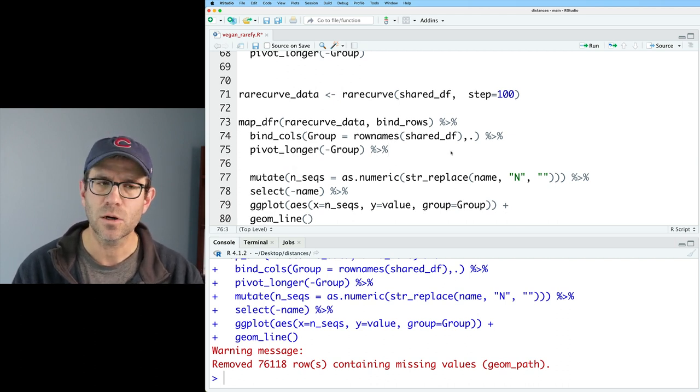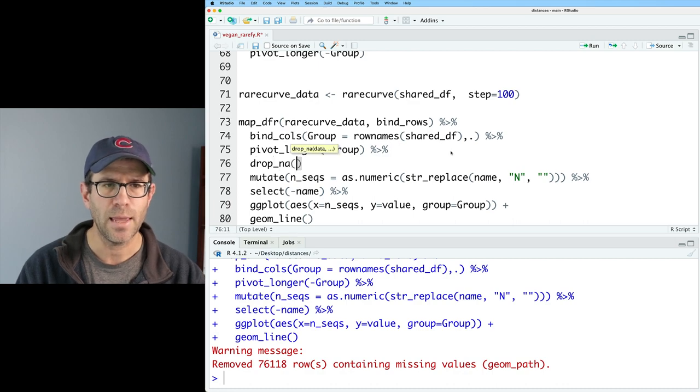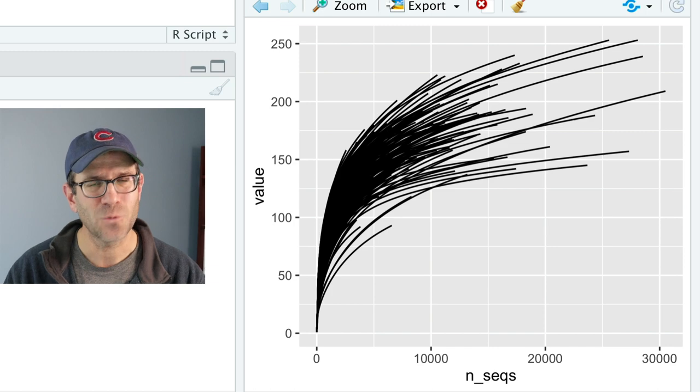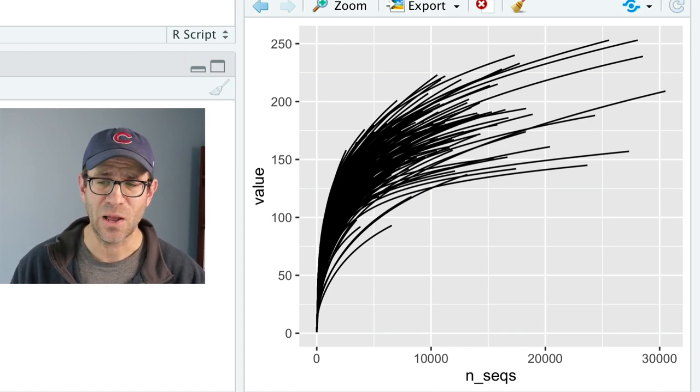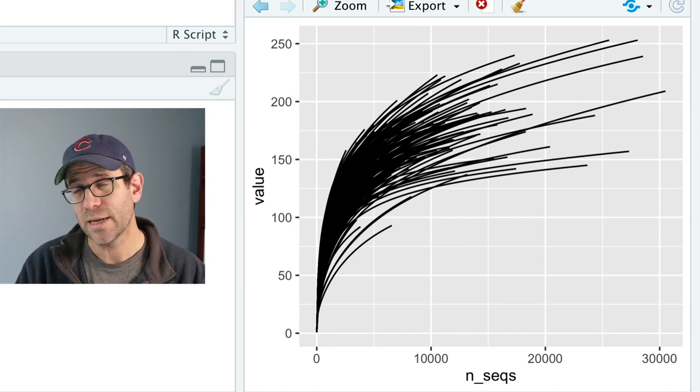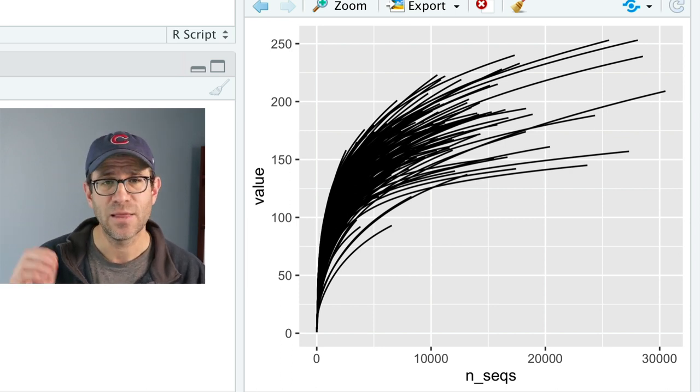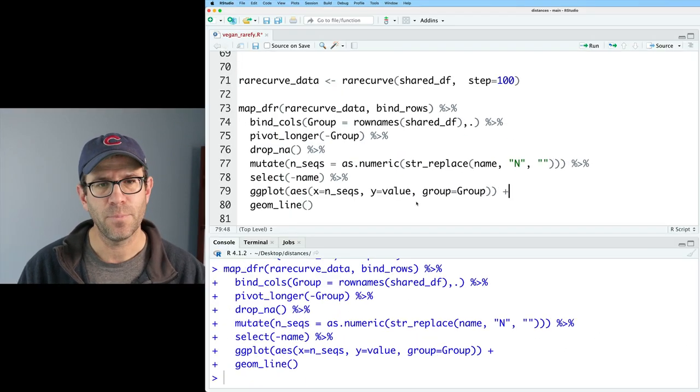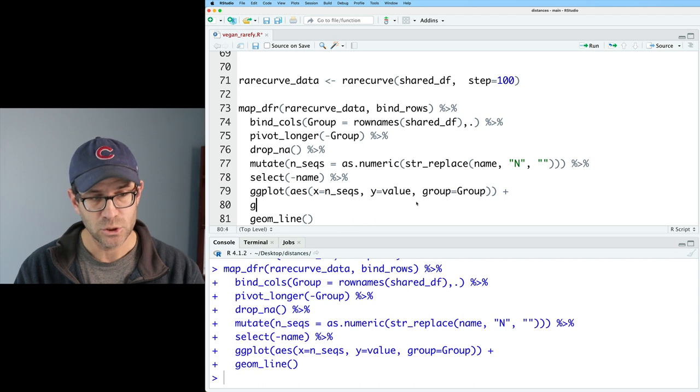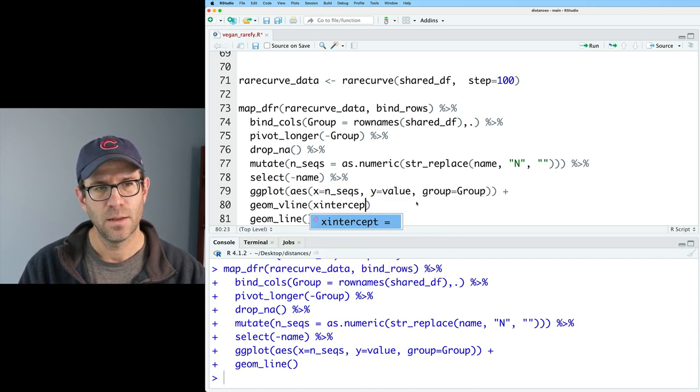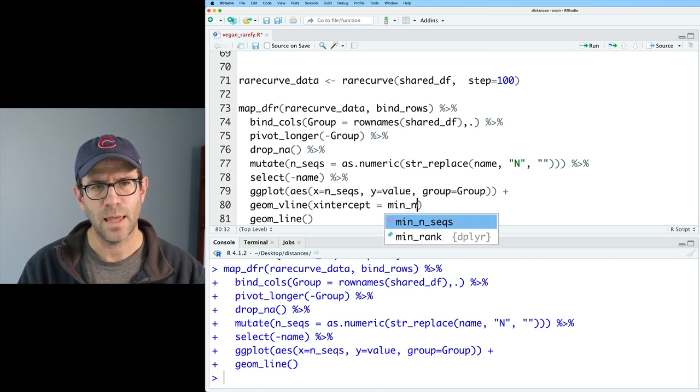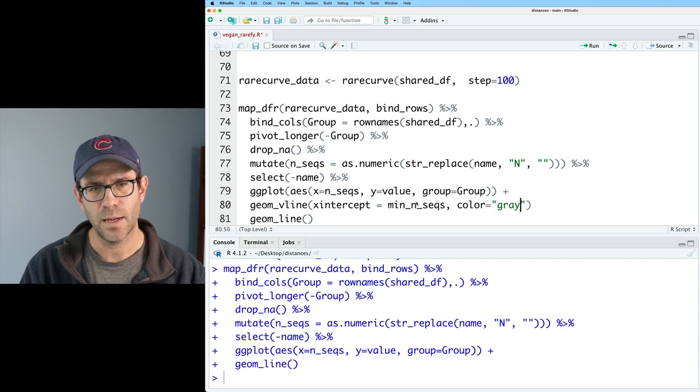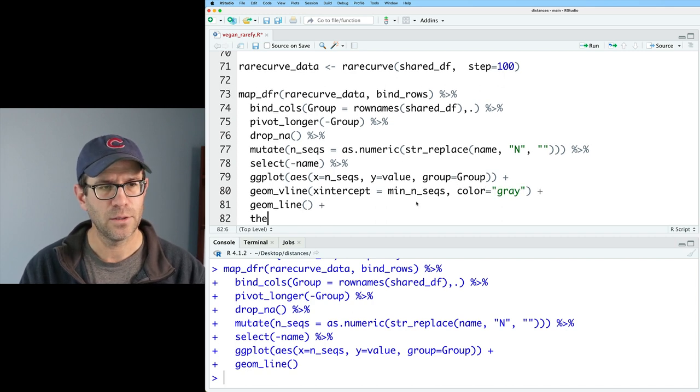So after pivot_longer, I'm going to go ahead and do a drop_na and feed that into the rest of the pipeline. So there we go. We have 227 rarefaction curves. That's not super helpful. You know, something that we might add to this would be a vertical line to indicate the depth of sampling that we've been using, that min_nseqs. So I'm going to go ahead and before running geom_line, I'm going to run geom_vline. And I'll say x_intercept equals min_nseqs. And I will make this color equals gray and add that to there. And I'm going to go ahead and do theme_classic.